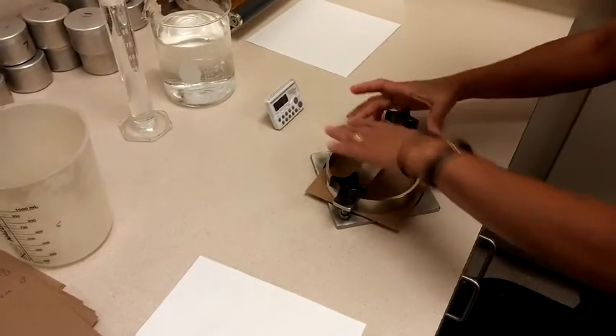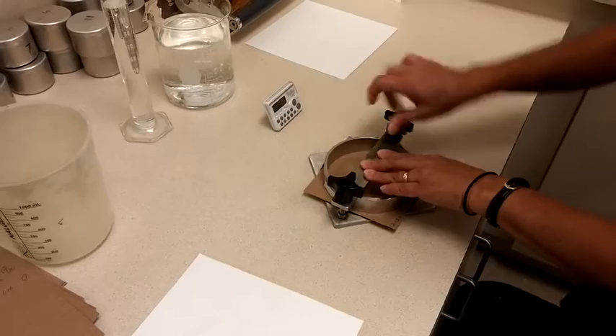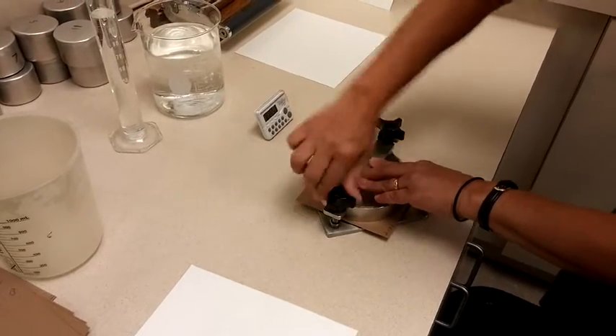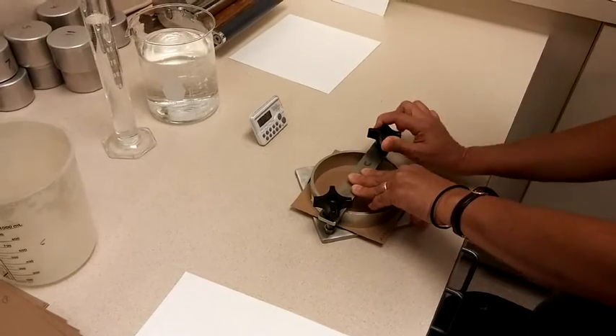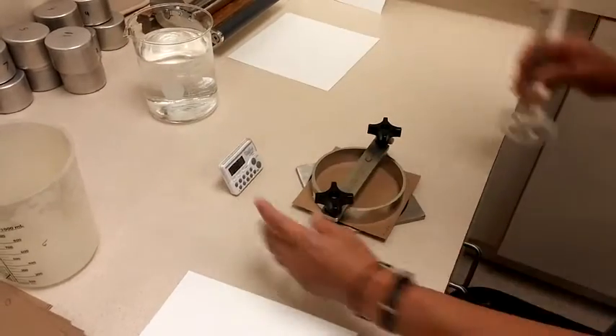WaterCob is a test of surface and internal sizing. It can be run from either the back side or the coated side of the paper. The test evaluates a different property of the paper depending on the surface tested.